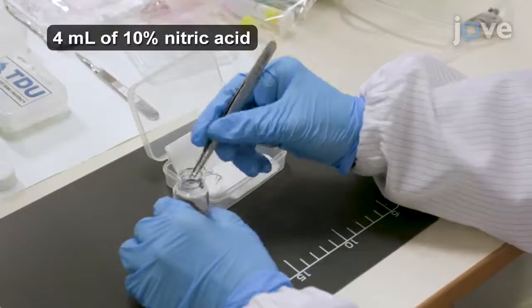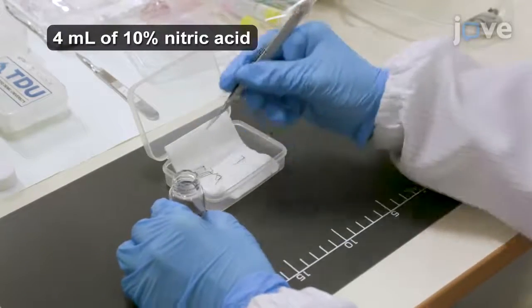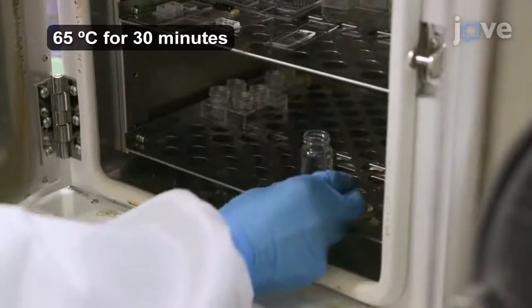Have ready 4 milliliters of 10% nitric acid and immerse the pins in it. Then place the container in a 65 degrees Celsius oven for 30 minutes.